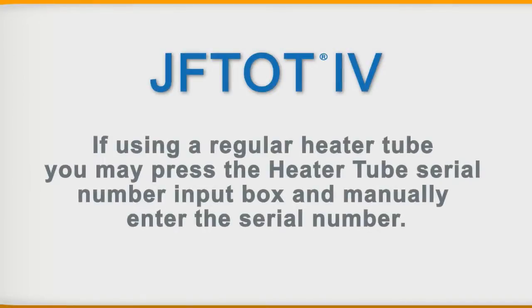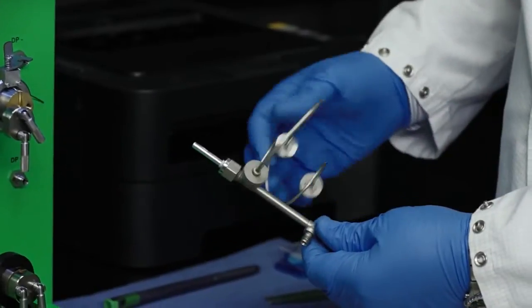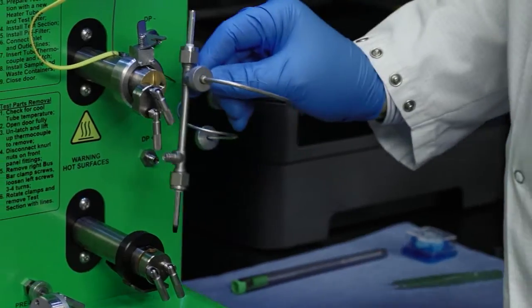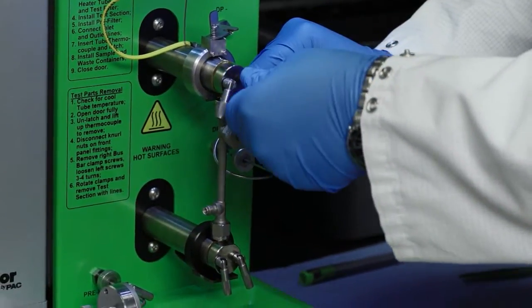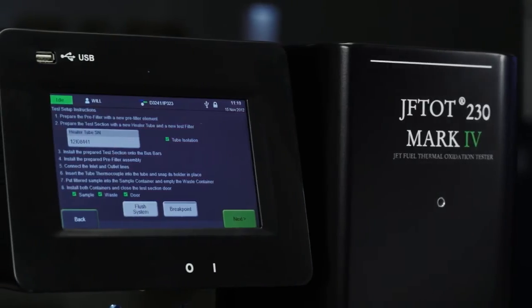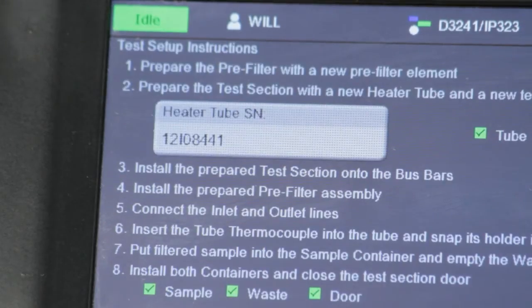If using a regular heater tube, you may press the heater tube serial number input box and manually enter the serial number. Otherwise, continue with installing the test components. Do a quick inspection of the test section assembly, and after you confirm that it's correct, install it in the bus bars. If you use an intelligent heater tube, the serial number will automatically populate the heater tube serial number box.